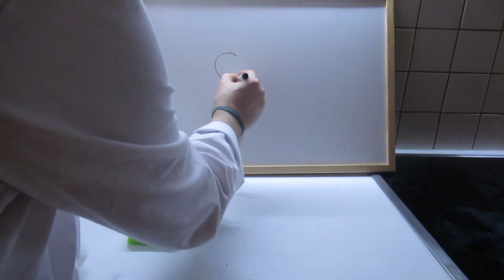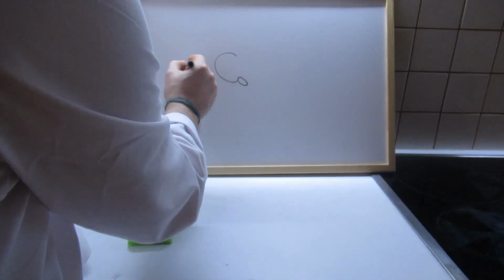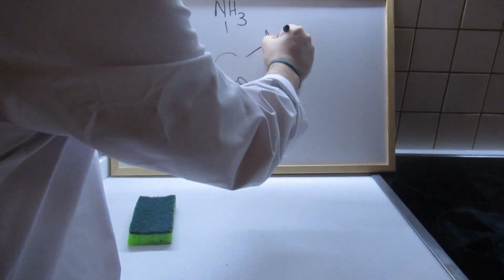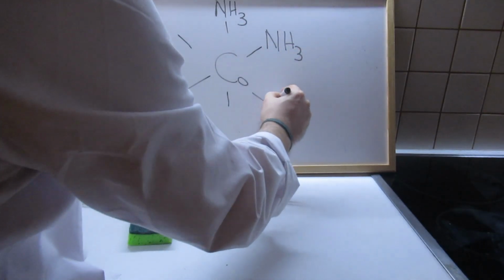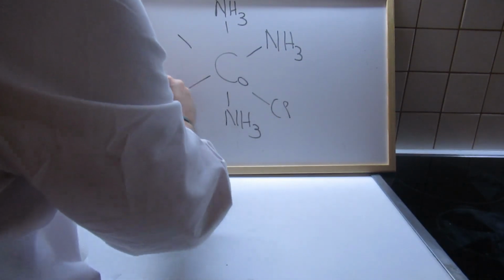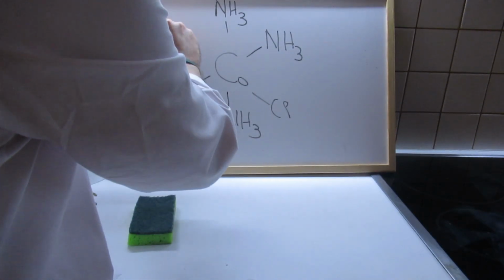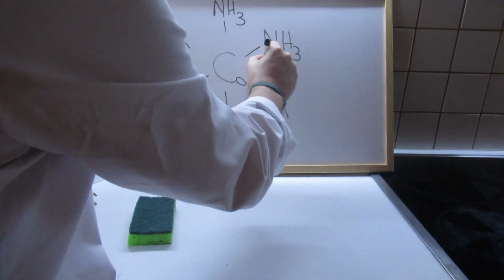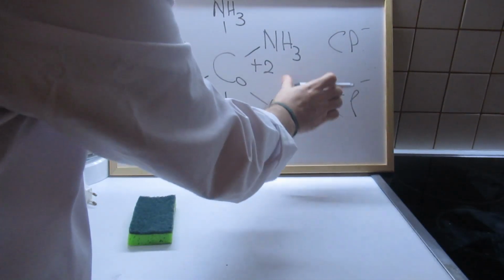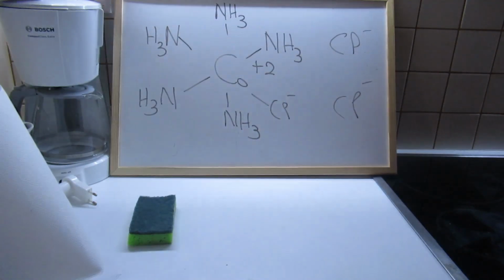Let me give you an idea of how this complex actually looks. So, this complex looks like that.